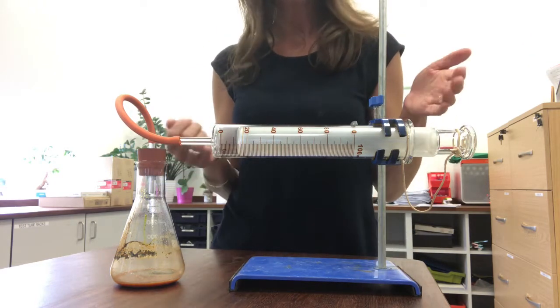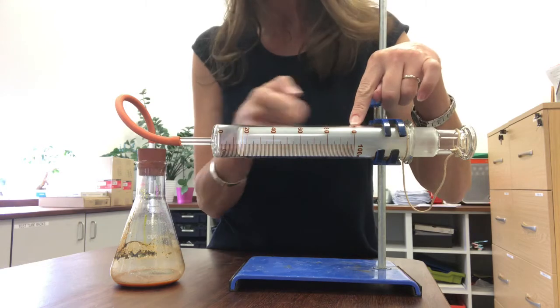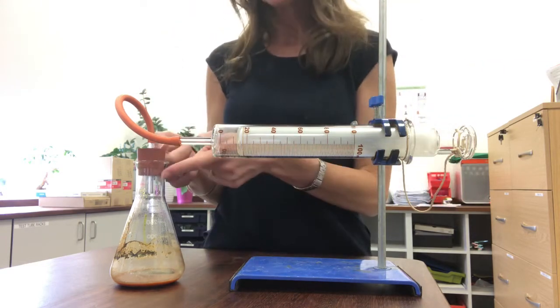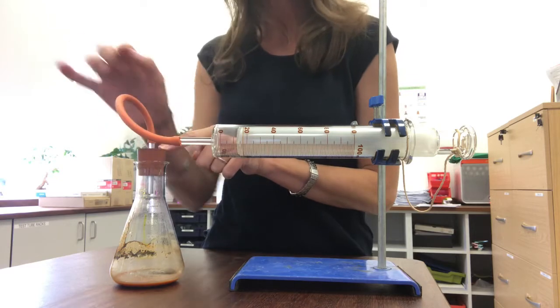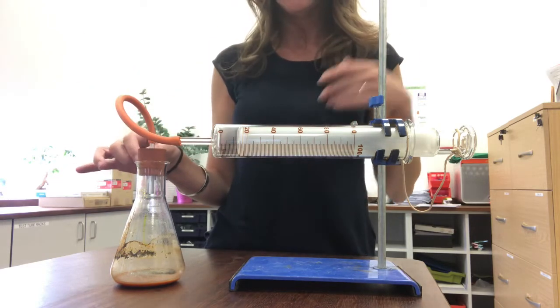Now at the beginning of this reaction we calculated that there were 100 millilitres of gas in the syringe. There were 315 millilitres of gas in the flask and we were going to ignore the volume that was in the tube. We said that was negligible in comparison.